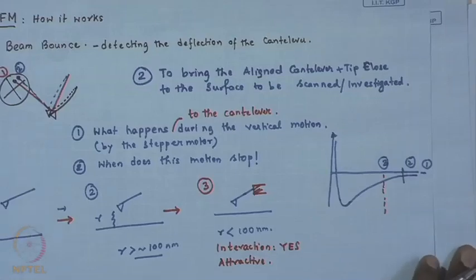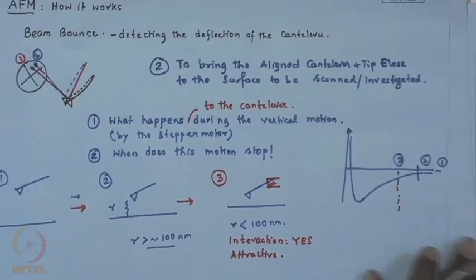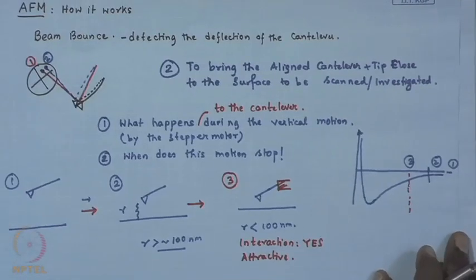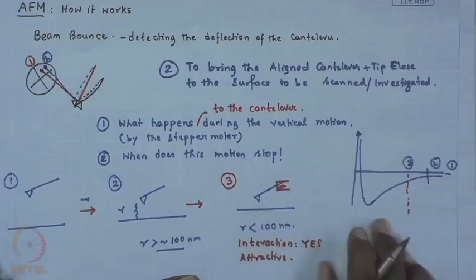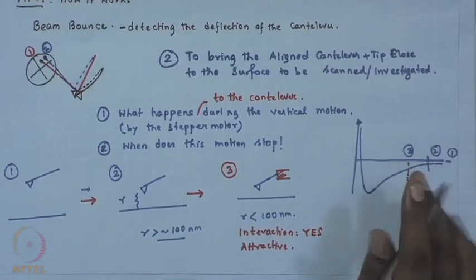Okay. And then in the previous class we had talked in greater detail about the spring constant, the material or the stiffness of the spring or the cantilever you choose. And we had argued that we will always go in for a soft spring or a cantilever with a lower spring constant. So, what does it mean, and how low is low? Essentially, it is in such a range that it deforms to these type of intersurface forces. So, you now have a cantilever which responds to these attraction forces.